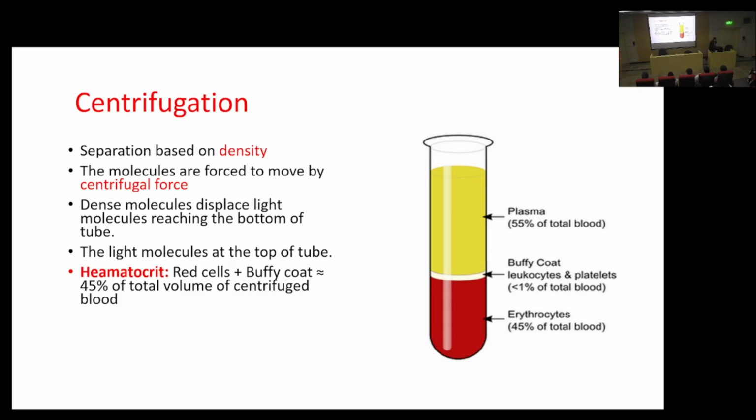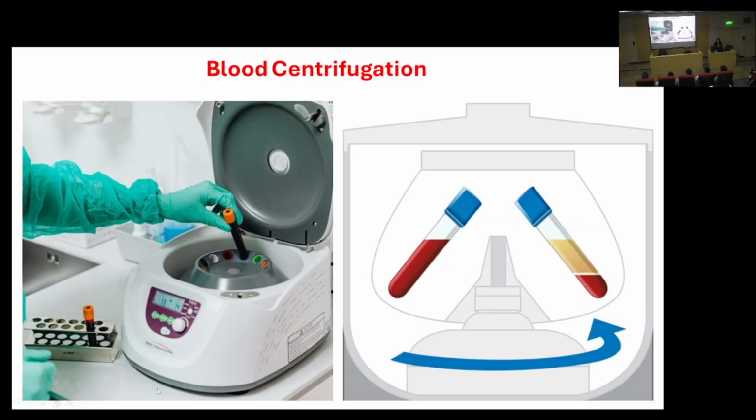I'm just going to show you the machine, how it looks. So imagine you take a blood tube and you put it in the centrifuge machine. It looks something like this. You will do this downstairs. You will see a centrifuge machine. Just have a look.